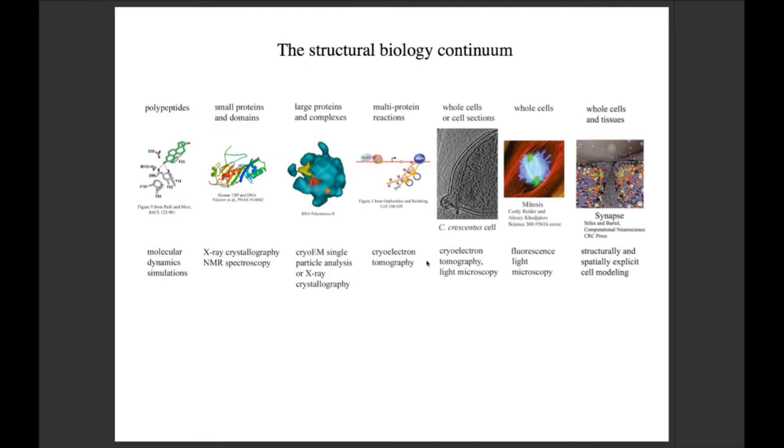So that's one of the really nice things about Cryo-EM: how flexible it is as a tool for structure determination. We can work anywhere from the 100-ish kilodalton range up to megadaltons for ribosomes and large complexes like that, with the help of phase plates, energy filters, and other things that we'll talk about today.